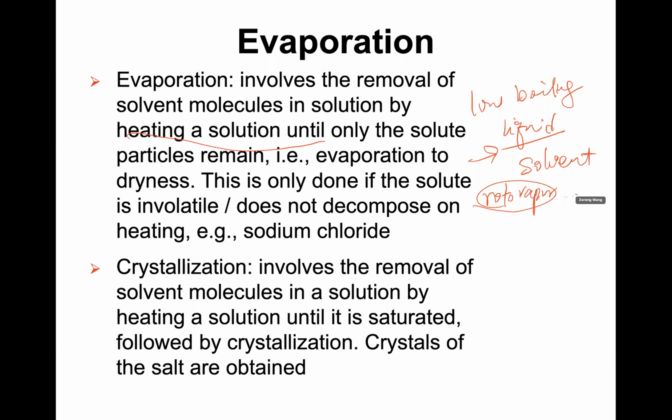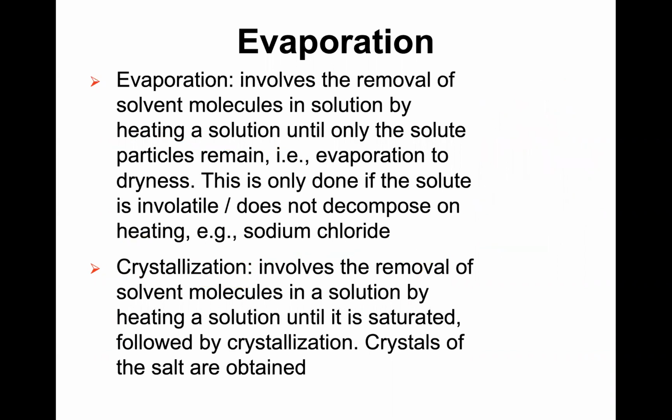Okay, and another one is crystallization. This one we often use, and it is also often used in industry, because you can use it on a large scale. So think about how crystallization works. If you have a solvent, and we have some solute, for example, that is able to dissolve in the solvent. However, the solubility, we will see.